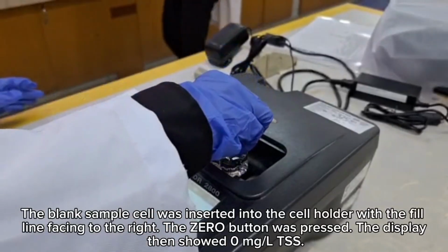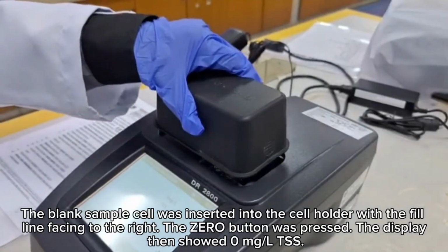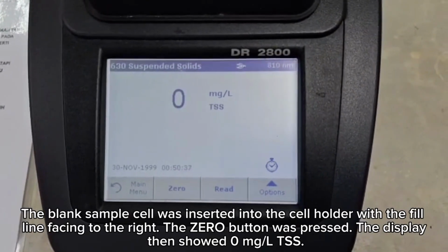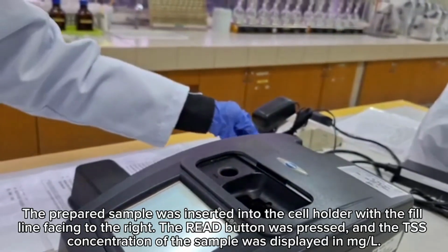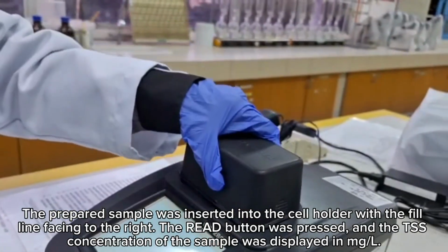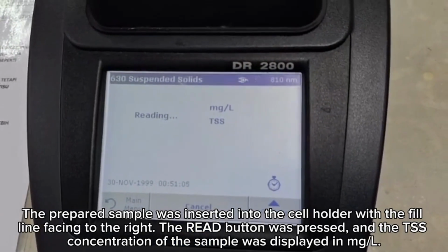The blank sample cell was inserted into the cell holder with the fill line facing to the right. The 0 button was pressed. The display then showed 0 milligrams per liter TSS. The prepared sample was inserted into the cell holder with the fill line facing to the right. The read button was pressed, and the TSS concentration of the sample was displayed in mg/L.